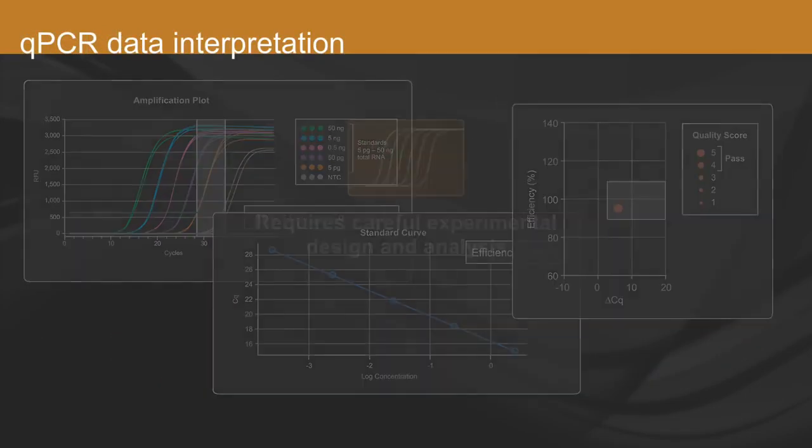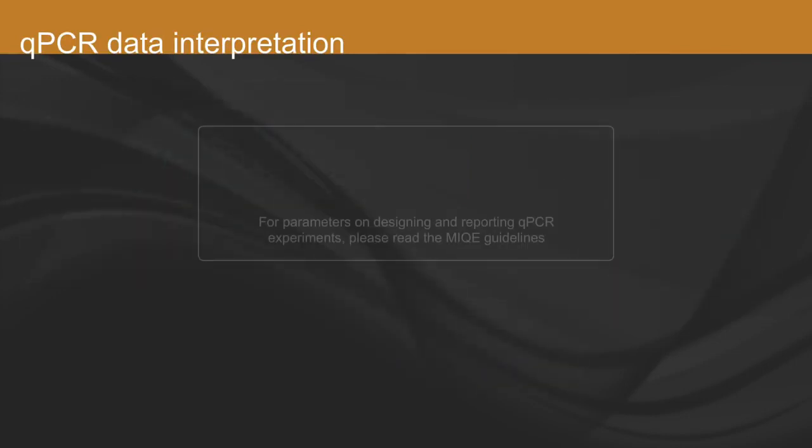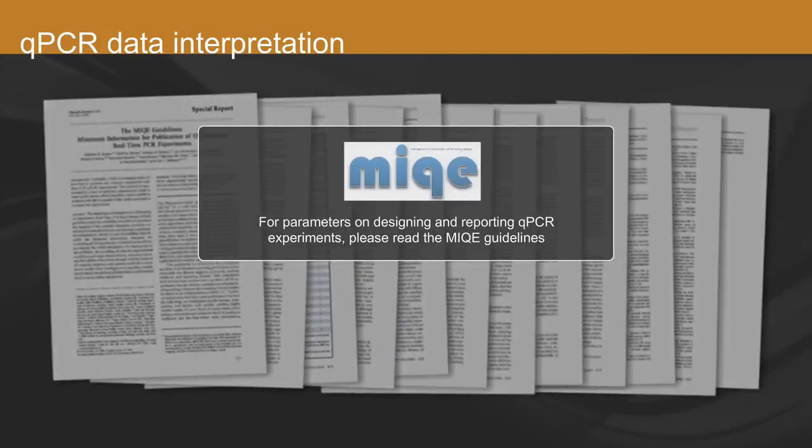Interpretation of qPCR data requires careful experimental design and analysis. For parameters on designing and reporting qPCR experiments, please read the MIQE guidelines, which have been established to ensure consistent experimental design and data analysis appropriate for peer-reviewed publication.